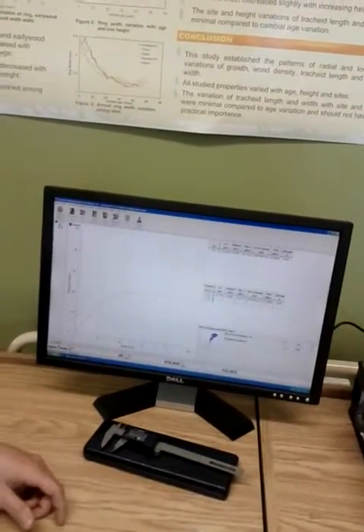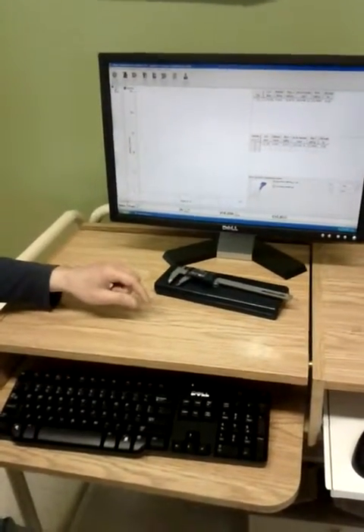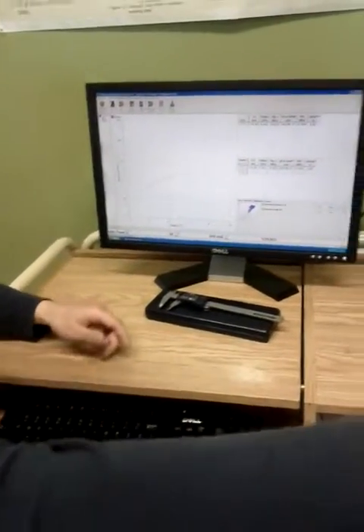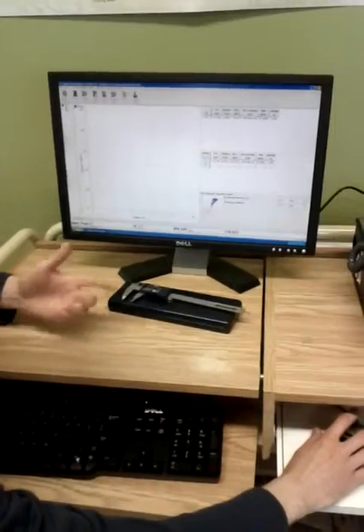So just to show you an example: if I press LE before I remove the sample, or if I ask to go back to LE automatically, it will touch the sample like this. Yeah, exactly. So you don't want that. All right.